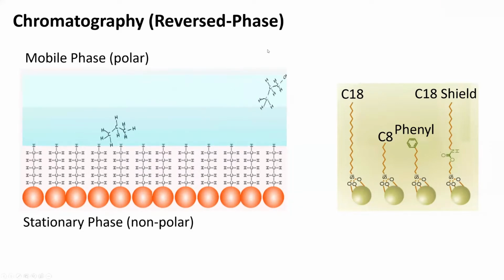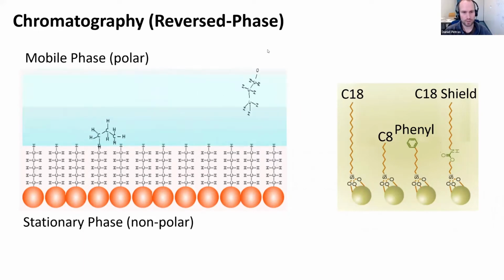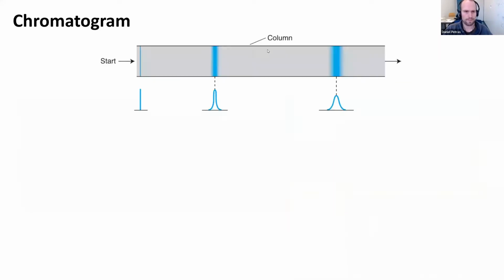I think for many mass spectrometrists, this is mainly a way to bring your samples into the mass spec, but having good chromatography is really essential if you want to do nice LC-MS data acquisition, because the better your separation is, the better your eventual signal to noise is, and the cleaner your mass spectra, which has in particular implications for tandem mass spectrometry.